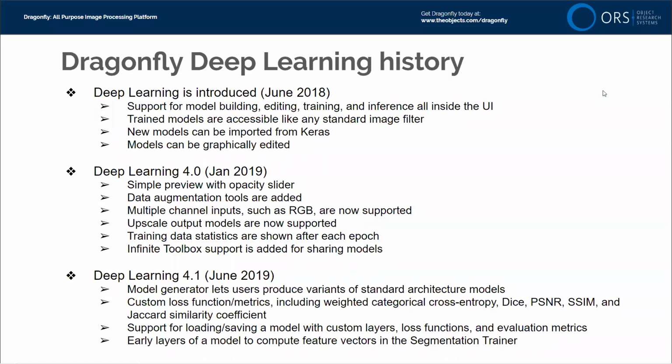It's called Segmentation Trainer. And when you use Segmentation Trainer, you are able to tell it what filters should be applied to your image, and it interprets all of those filters and tries to identify the different signatures between different materials of your image. How do those features or the feature vectors of the different materials stack up?